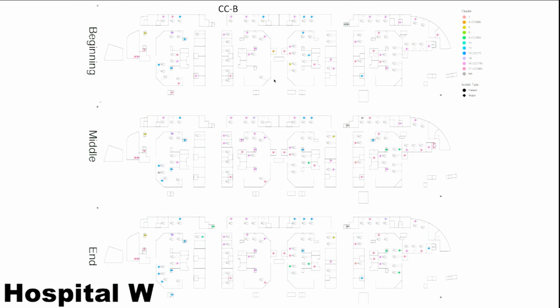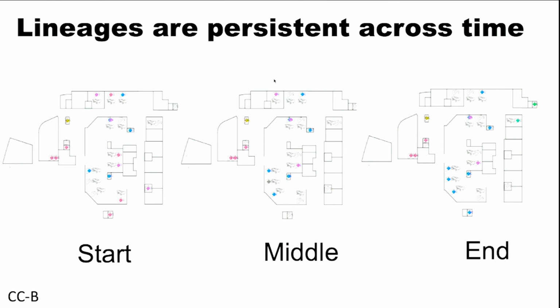If we draw this onto a map of our 4 ITUs, we have 4 ITUs that are arranged contiguously. What we've done here is we've sampled water from the hospitals at 3 time points over the period of 3 months. The simple thing here is just to check, if we sample the same water outlet over 3 time points, do you see the same clone in the same tap or in the same water-associated environment? And we do. Effectively, taps seem to be quite commonly persistently colonized, and you see the same clone in the same place at different sampling periods. Next slide. This is just a zoomed-in version to show you that that's the case. You see these different lineages associated with different taps.